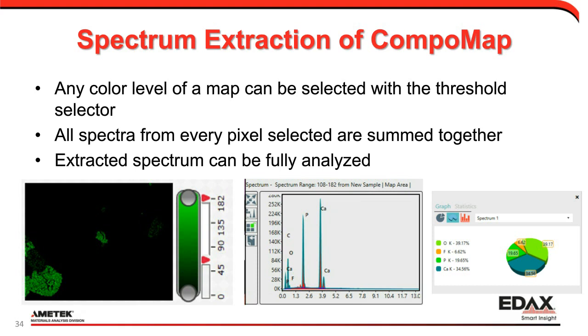How much does such chemically resolved phase-separated interface elemental concentration correlate with the accuracy of, say, atom probe? Very good question. If you are fortunate to have an atom probe, I suggest that you use your atom probe to truly define your composition. APT, atom probe tomography, is one of the best techniques for analyzing atom by atom.